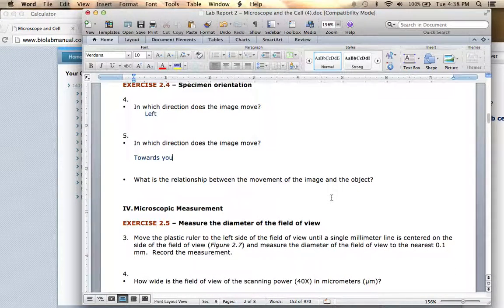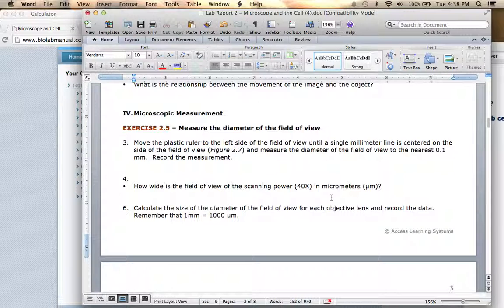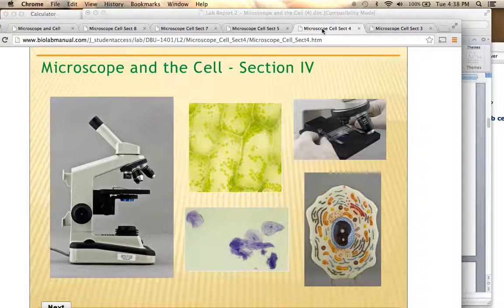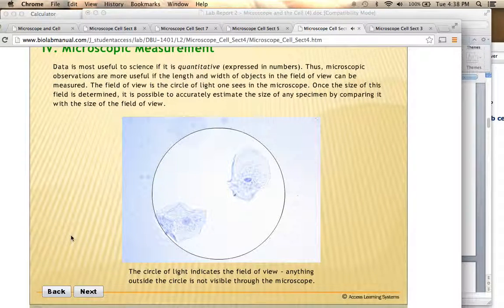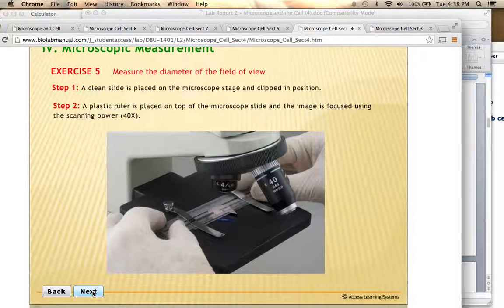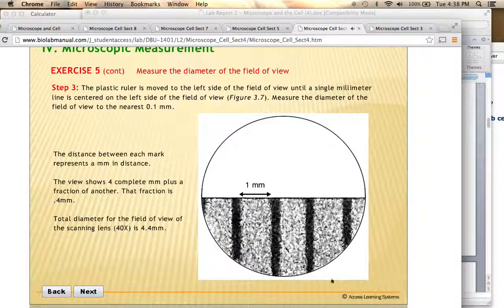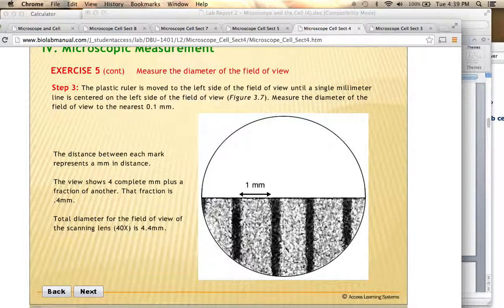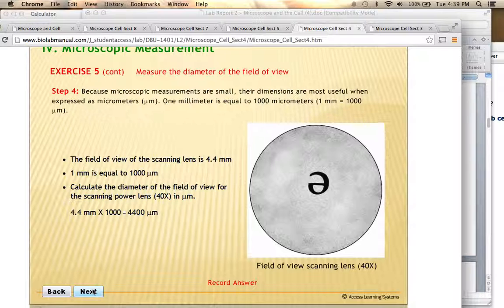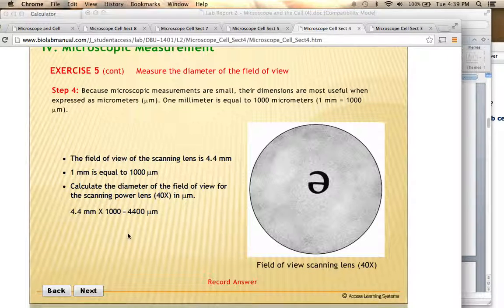The next section is on microscopic measurement — this is a section that a lot of students have some trouble with, so I'm going to go through this in a little bit more detail. This view is actually what you would see looking through the microscope with the scanning lens at 40x total magnification. The total diameter you're seeing with this ruler is about 4.4 millimeters — each of those little units is one millimeter — so the field of view diameter for the scanning lens is 4.4 millimeters.